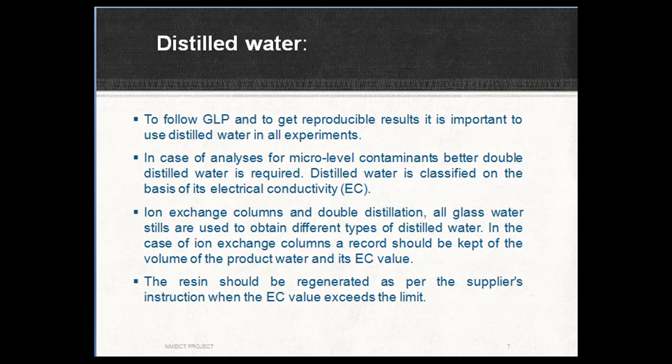To follow GLP and to get reproducible results, it is important to use distilled water in all experiments. In the case of analysis for micro-level contaminants, double-distilled water is required. Distilled water is classified on the basis of its electrical conductivity. Ion exchange columns and double-distillation glass stills are used to obtain different types of distilled water. In the case of ion exchange columns, a record should be kept of the volume of product water and EC value. The resin should be regenerated as per the supplier's instructions.